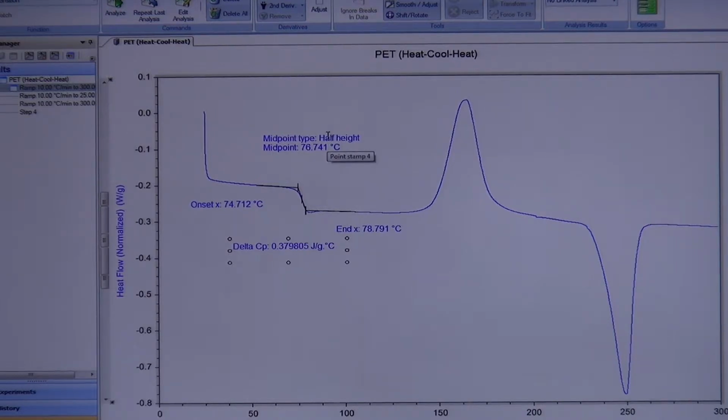There are a few ways to do that. I would argue it's much better to be consistent in how you're measuring them, because that way you can compare each measurement to another one. If you change how you measure this, for example, if I do it in the same experiment or on the same sample, you will see that this number itself will actually change, because it's selecting different points based on how you're measuring the glass transition temperature. So the physical number is going to be slightly different.